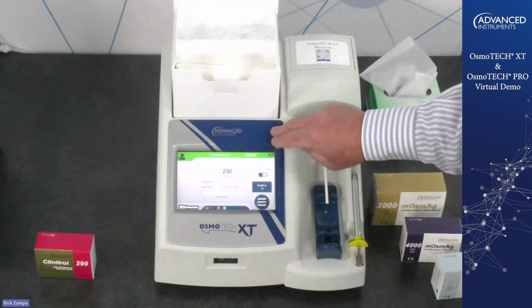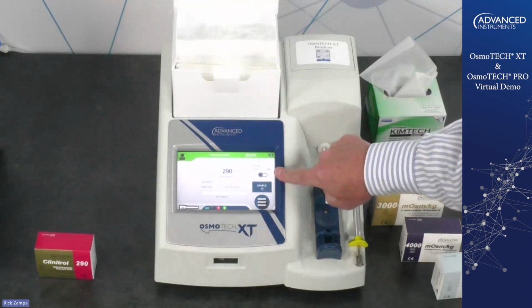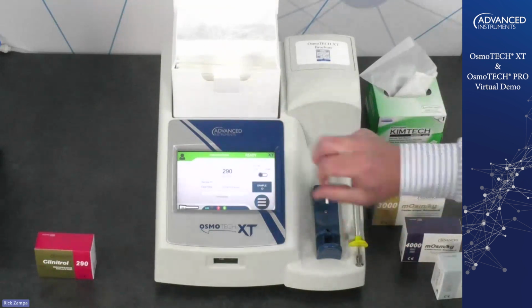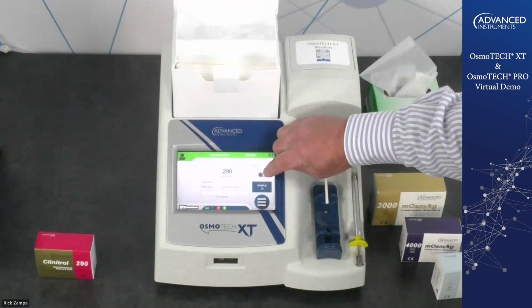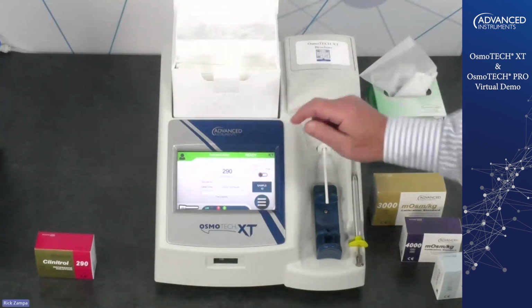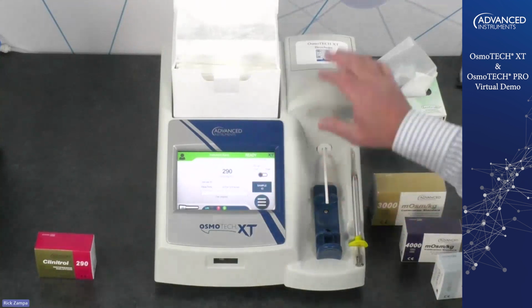We have our result in the middle. We have our range selection here. As Shweta said, it's a 0 to 4,000 milliosmol range of the instrument. It's broken down into two separate ranges, 0 to 1,500 milliosmoles and 1,500 to 4,000. To switch between the ranges, you just hit the button, and it switches back and over. There's no need to calibrate between switching ranges. It's already calibrated and ready to go.